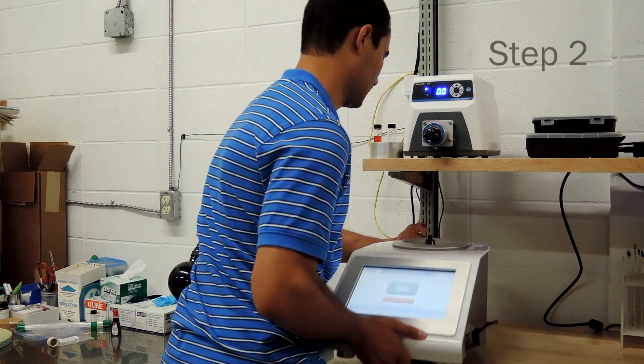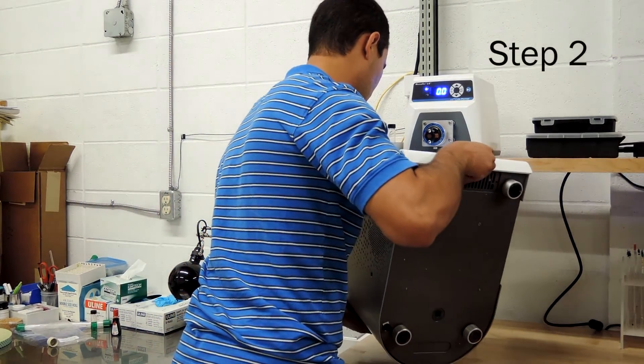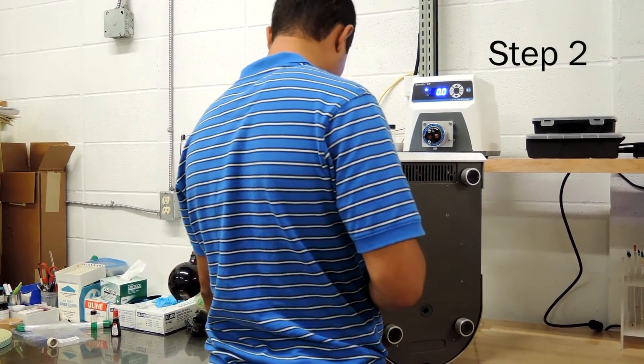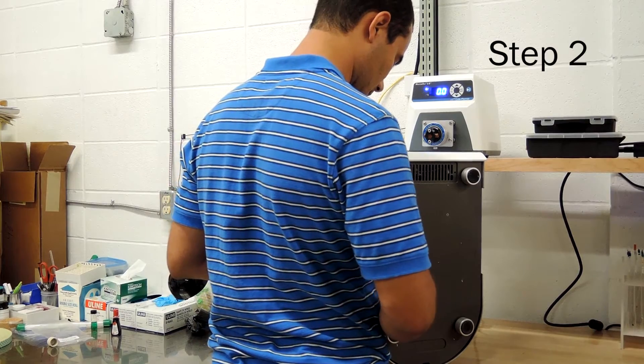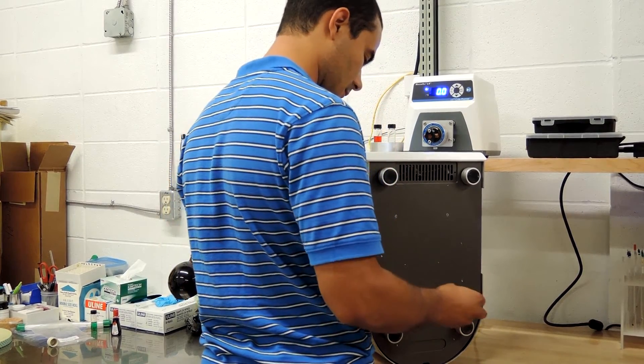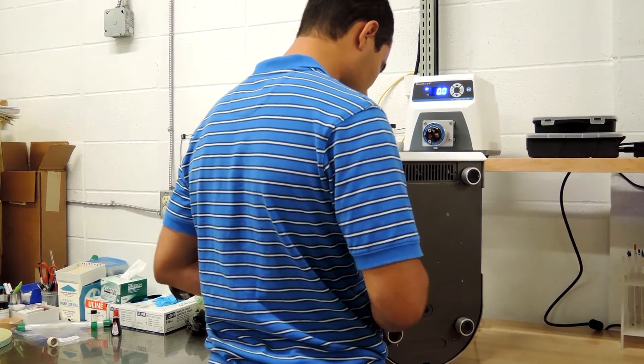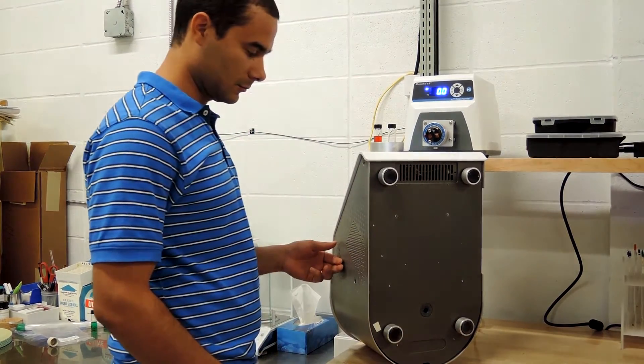Next, flip the instrument 90 degrees onto its back. The instrument has a flat back so it can rest on the table in this position as long as you are careful not to accidentally tip it over. Once it is on its back, you need to remove the bottom black stopper in the base of the instrument and replace it with the bottom flow adapter provided in the kit.